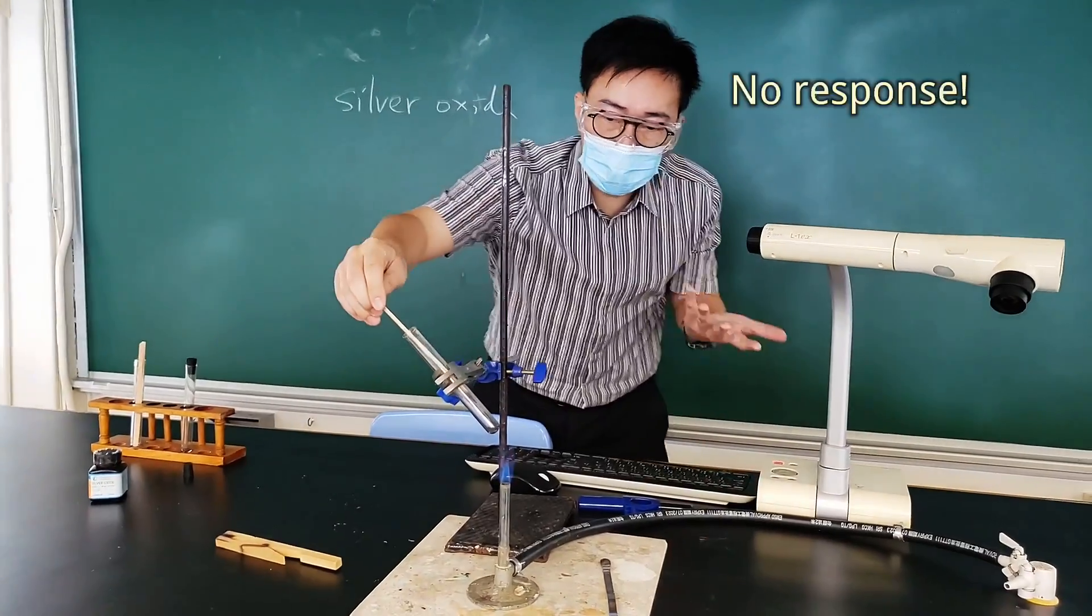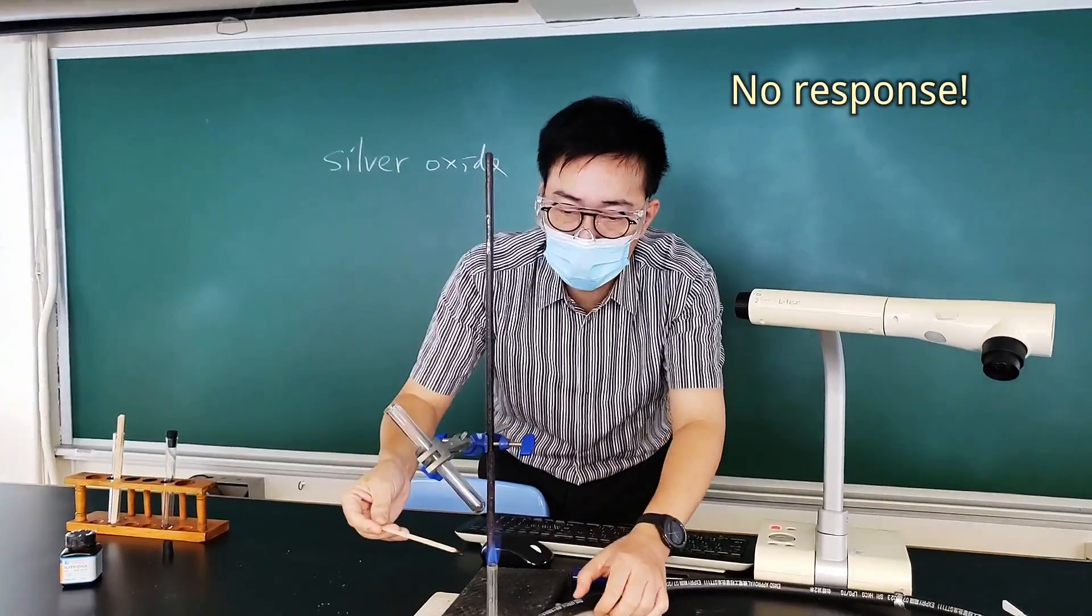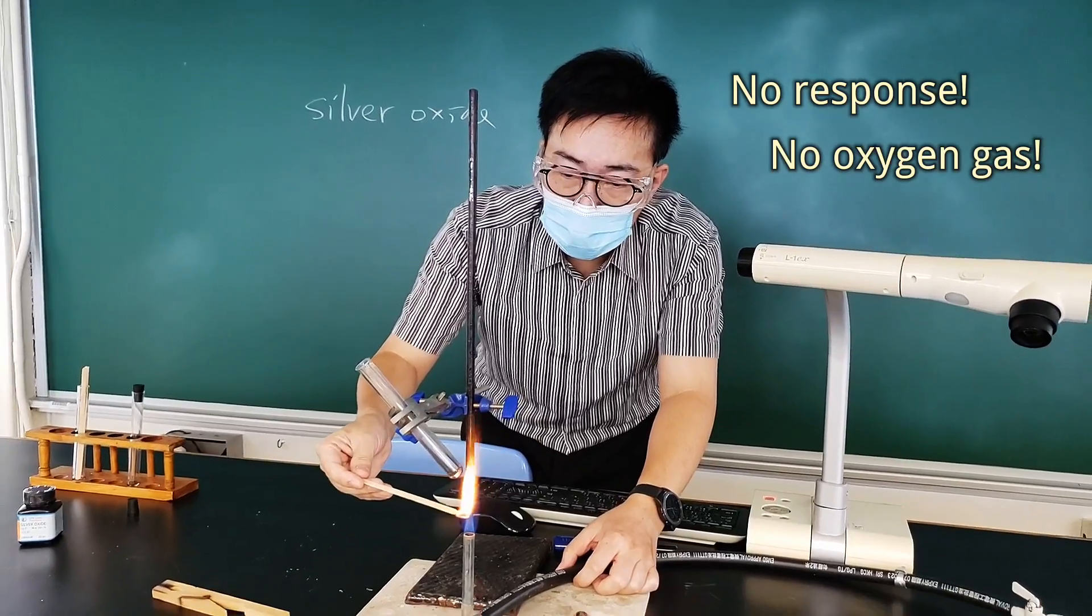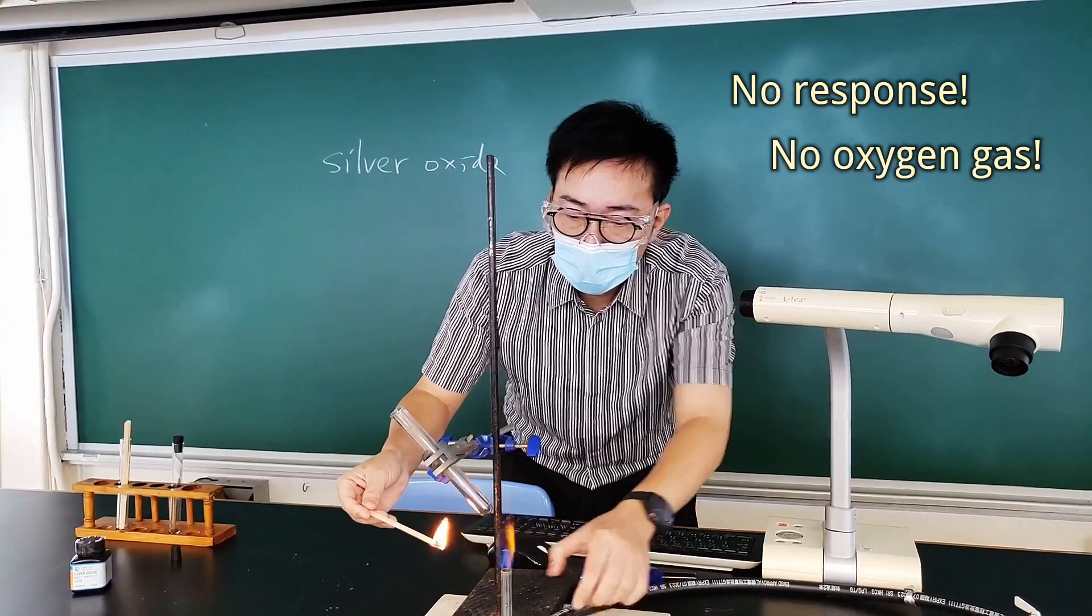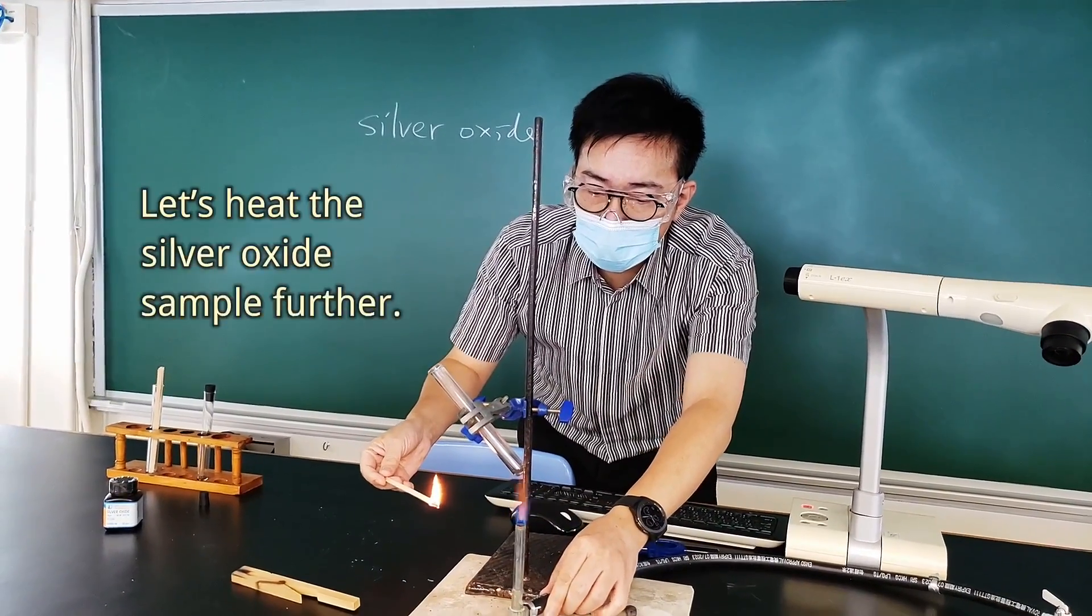Oh, no response. Okay, you don't see the light kind of glowing splint. That means no oxygen gas for the time being. Okay, so I need to keep heating the silver oxide.